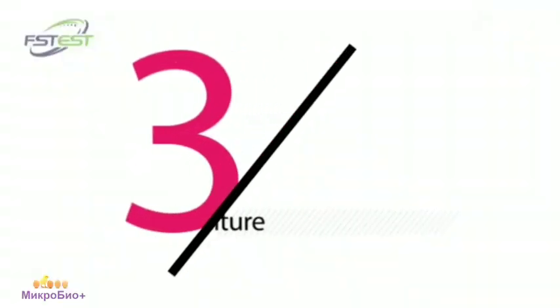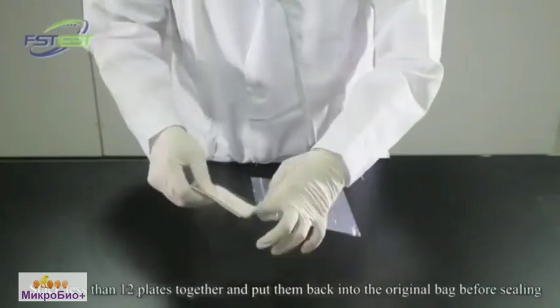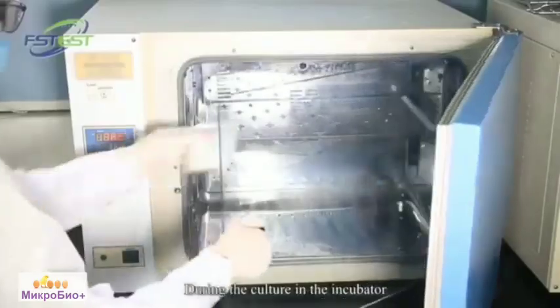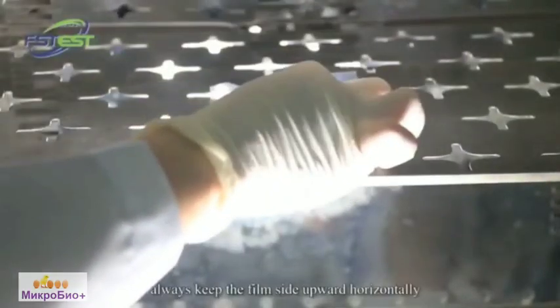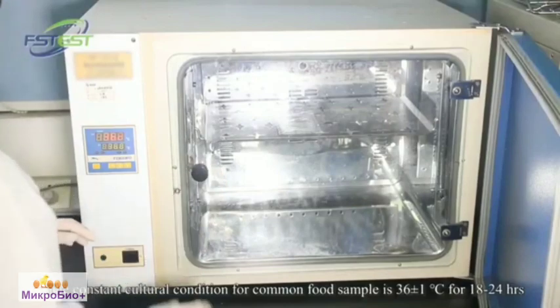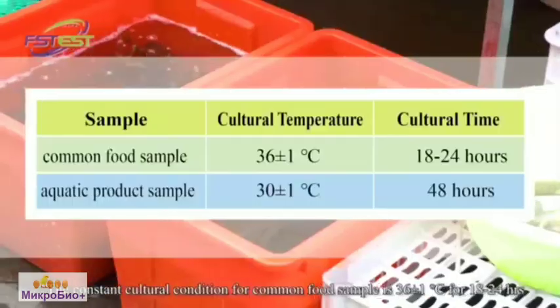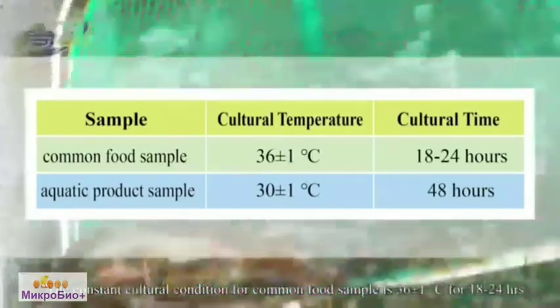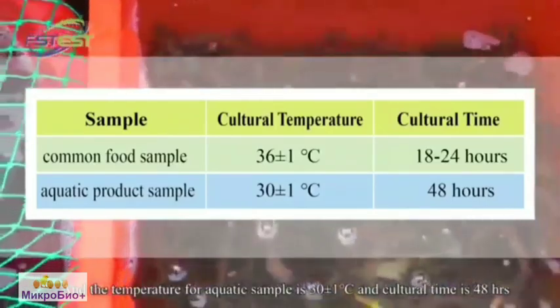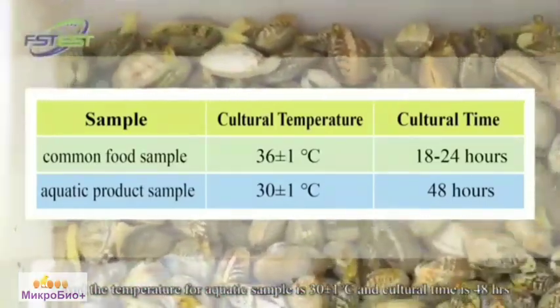Culture. Stack less than 12 plates together and put them back into the original bag before sealing. During culture in the incubator, always keep the film side upwards. The constant culture condition for common food samples is 36 plus or minus 1 Celsius for 18 to 24 hours. The temperature for aquatic samples is 30 plus or minus 1 Celsius, and the culture time is 48 hours.